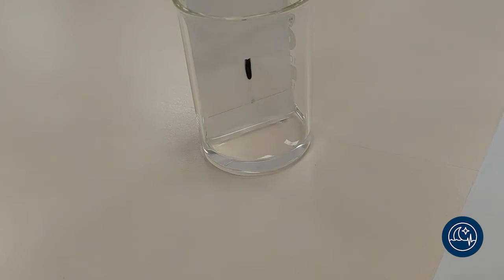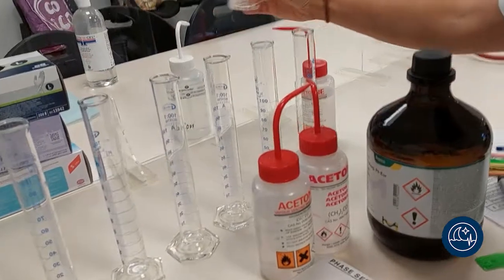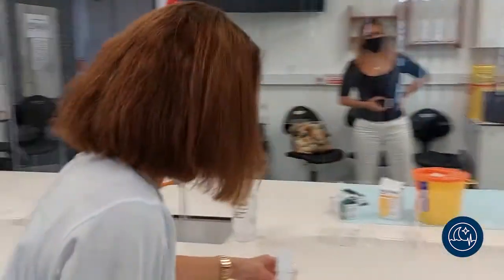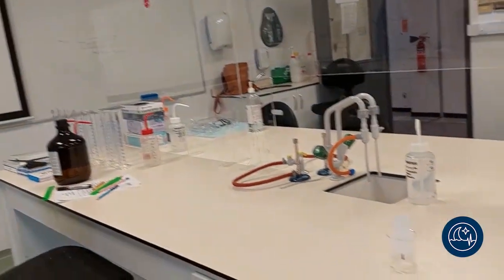Right, guys, and I have just realised that I've changed my sample, whose looks like this. I did, because I think my other one had dried out because I did it earlier. I changed it.